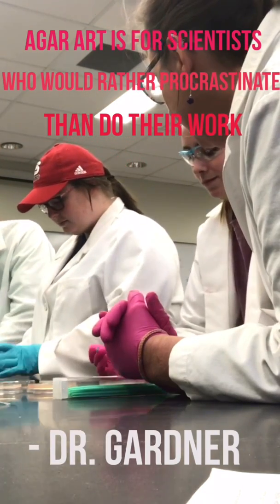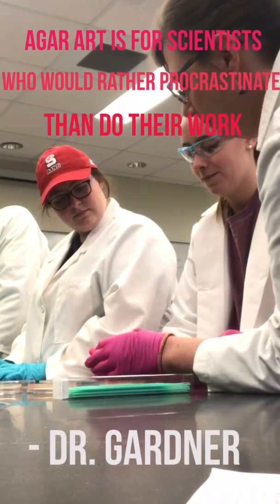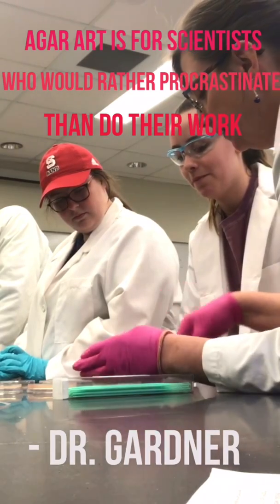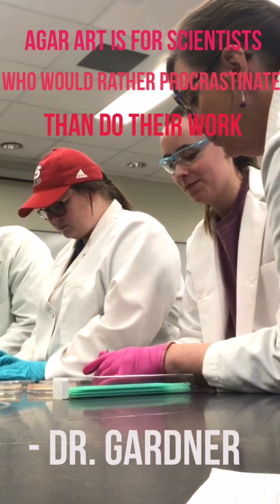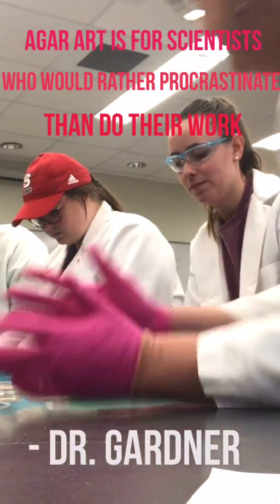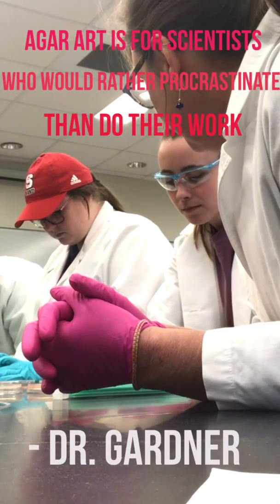You're going to put the lid down and hold the plate, because the problem is they slide all over. So you have to hold your plate, and then just start filling it in. And it's not that easy, because you've got that depth, so it's kind of weird.